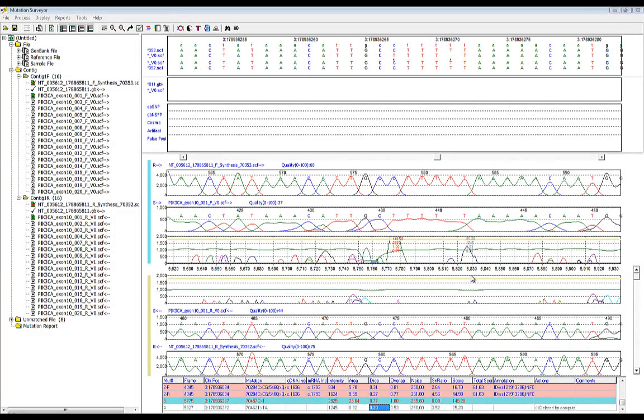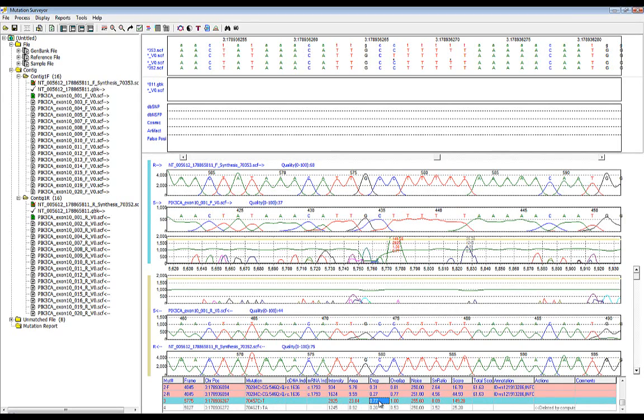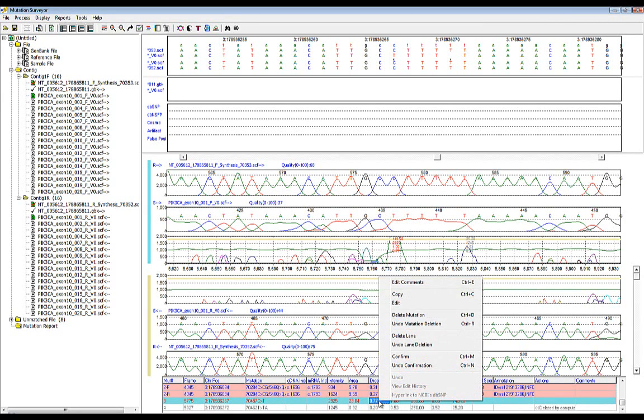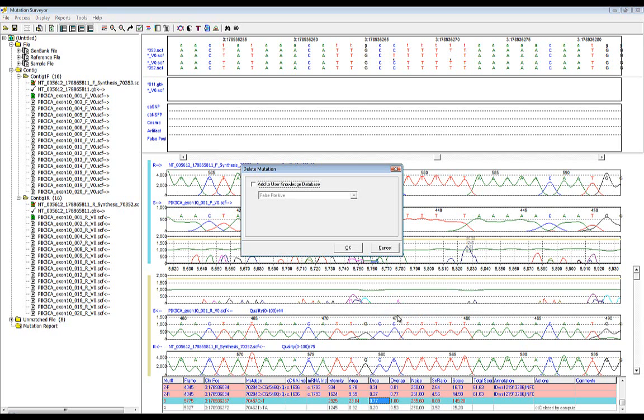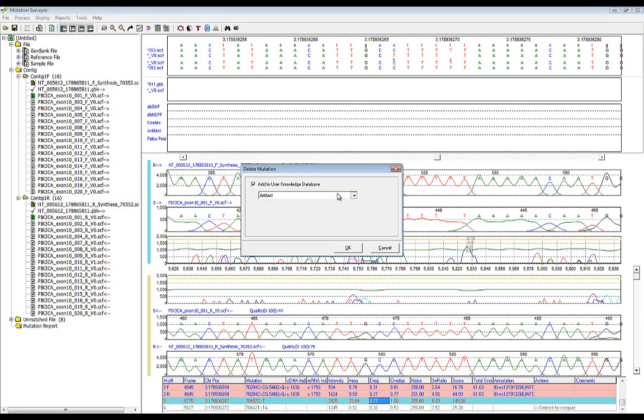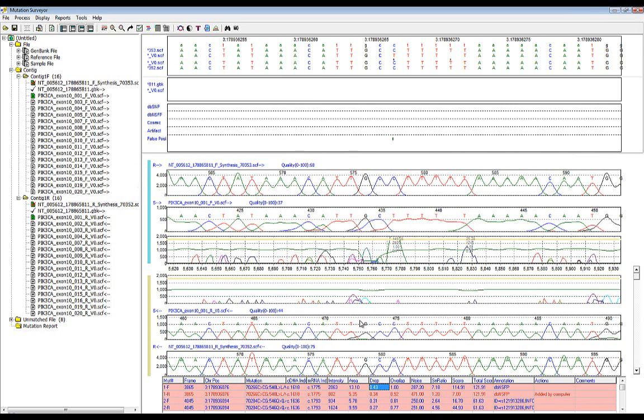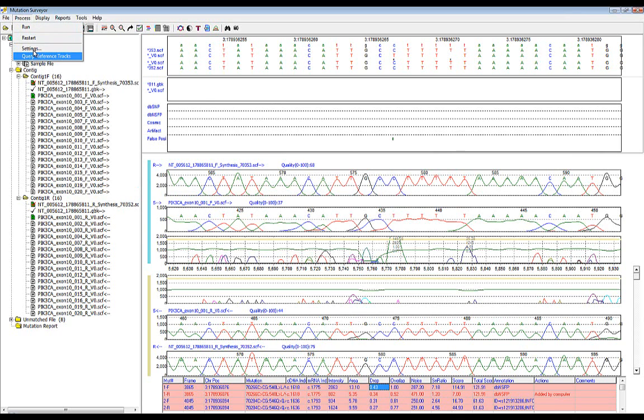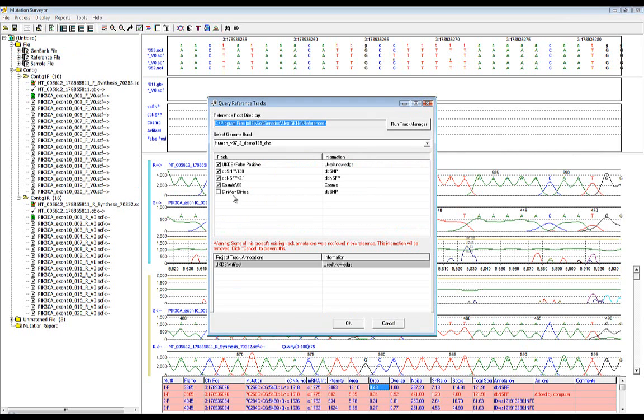In addition to the external database annotation, Mutation Surveyor 5.0 also allows users to build a custom database to monitor and track commonly deleted variants. These entries can be added by deleting any variant within a project. To add an entry, right-click the variant in the mutation report and select the option to delete mutation. Mutation Surveyor will then provide the option to add the variant to the user knowledge database as a false positive or sequencing artifact. After hitting OK, Mutation Surveyor will automatically add the entry for that position to the database. If this is the first variant you have added to the custom database, it is important to ensure that you return to the query reference tracks option to check the newly built database. In this way, Mutation Surveyor will automatically query these positions in future projects.